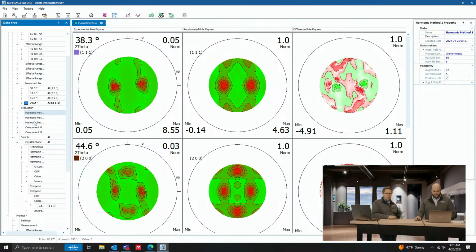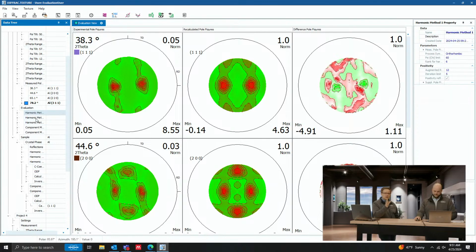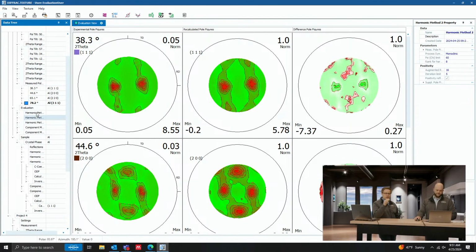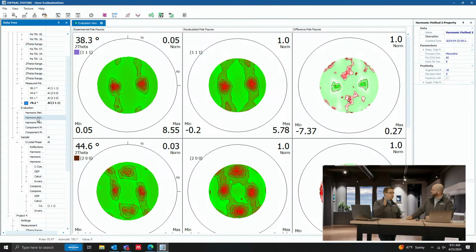So orthorhombic, that's imposing fourfold symmetry. Obviously, when you look at that left column, you can see it is different. It is not fourfold. It is different from the top to the bottom. But then we're imposing that symmetry on it, the orthorhombic. Exactly. Sometimes that's good because it does kind of force the model into a more stable state.